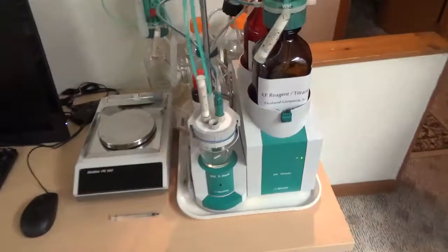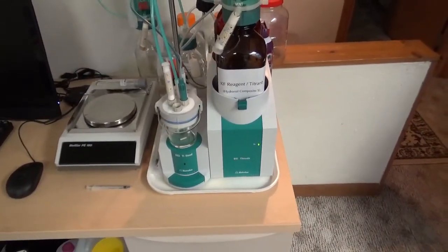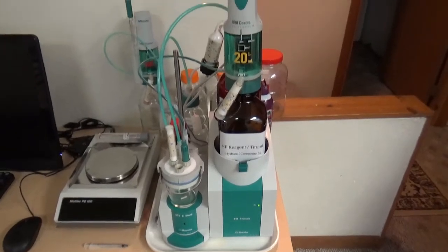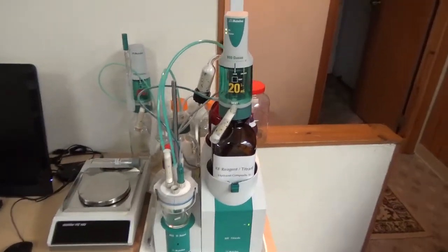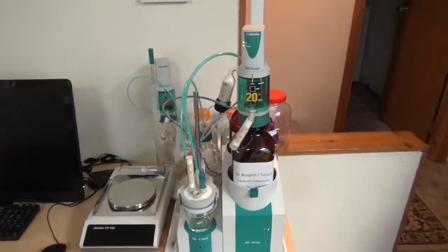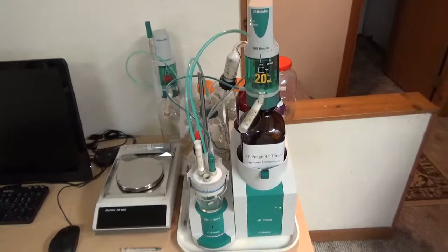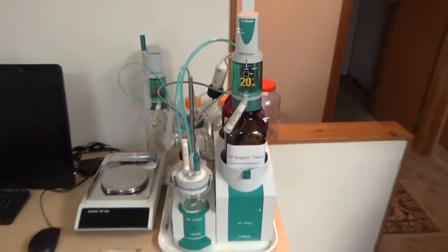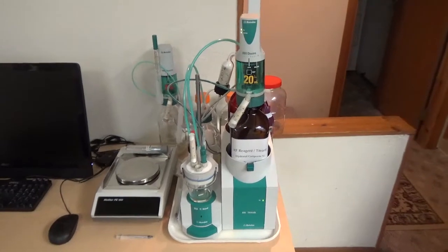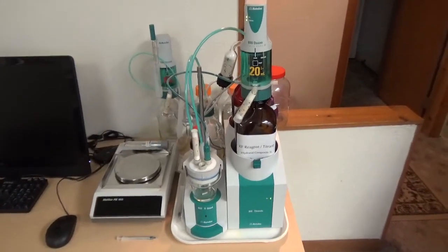We also have a Metrohm 841 Titrando with 803 Ti Stand, which is used for Karl Fischer titration. Karl Fischer titration has limited application in concrete — it determines moisture content. We do volumetric Karl Fischer titration for moisture content ranging from 0.1% up to 100%. To determine free moisture content in concrete — not the hydrated water, but the free water — we immerse the concrete sample in ethanol and do solvent replacement of moisture by ethanol.